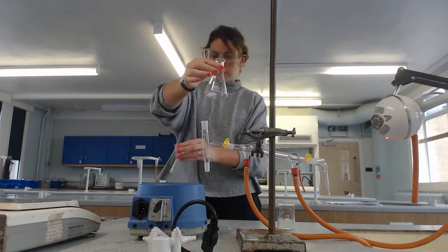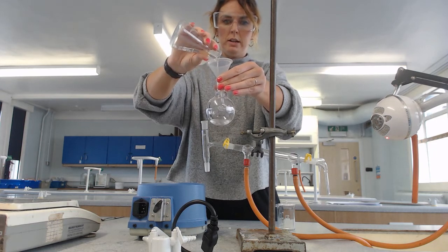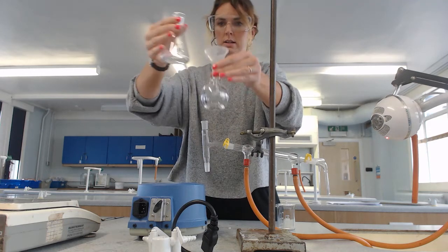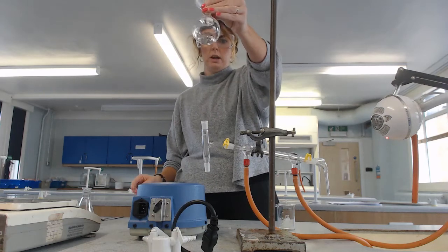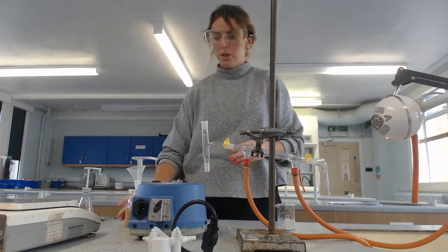I'm going to pour that in. There's my product — I'm just going to pop it in the cork stand for a moment, because I'm going to then add something to this once I take the funnel out.